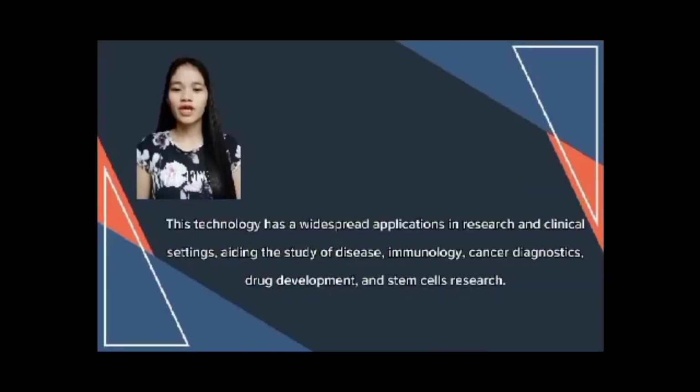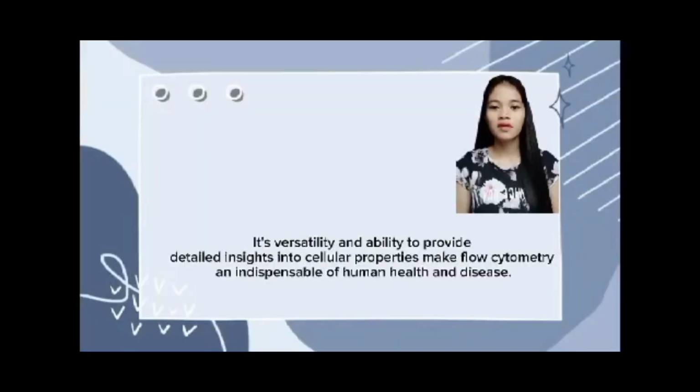This technology has widespread applications in research and clinical settings, aiding in the study of disease, immunology, cancer diagnostics, drug development, and stem cell research. Its versatility and ability to provide detailed insights into cellular properties make flow cytometry an indispensable tool in advancing our understanding of human health and disease.